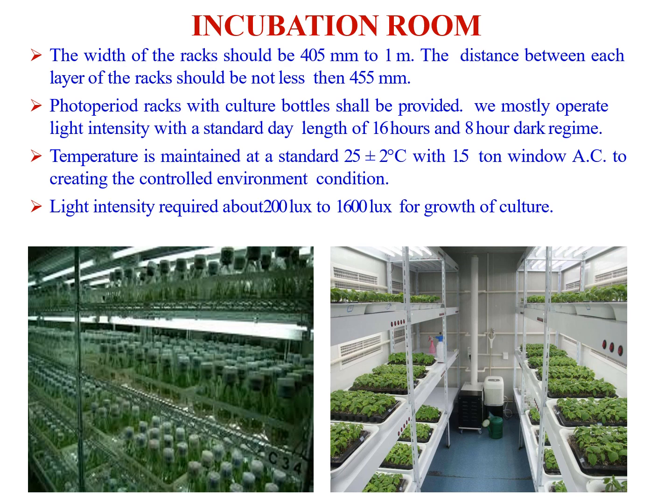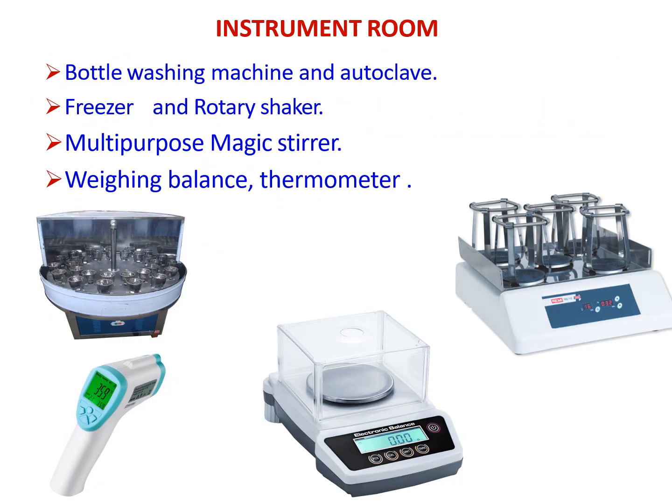And photoperiodism has to be given, like 8 hours dark and 16 hours we have to provide the lights. The light intensity of 1000 lux we have to provide.